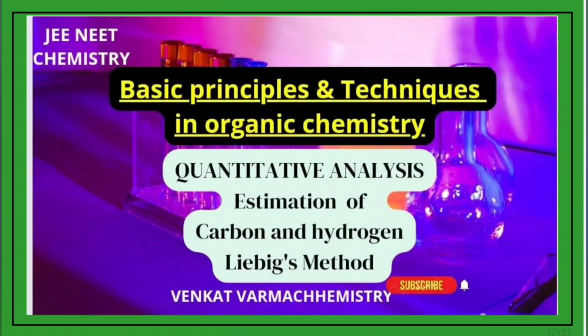After the detection of elements in the organic compound, the next step is determination of the percentage composition of the elements. Let's start our session.